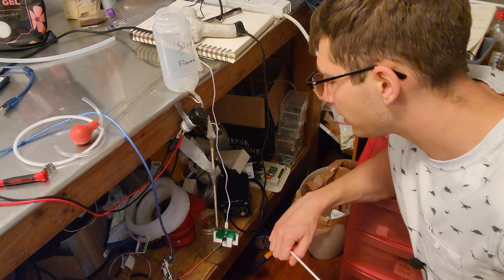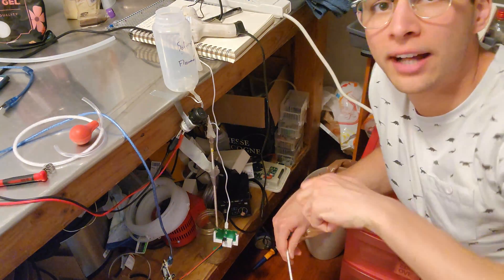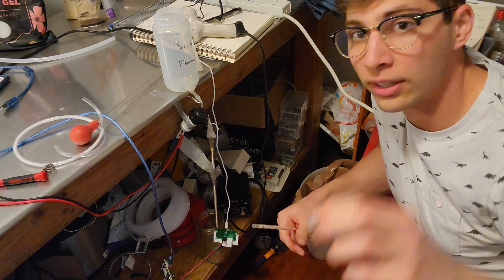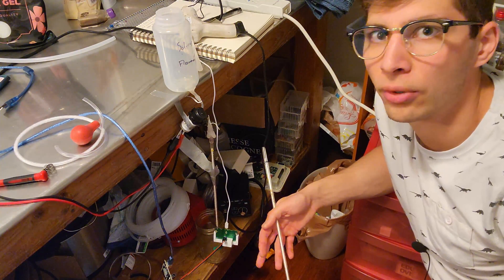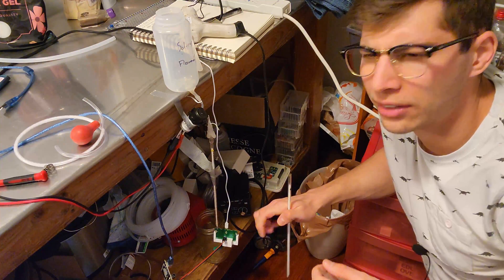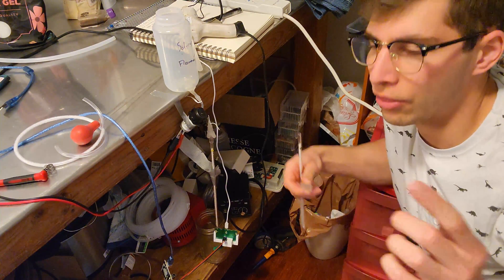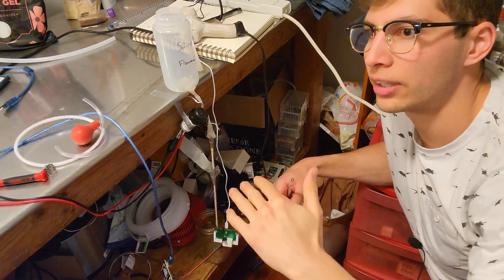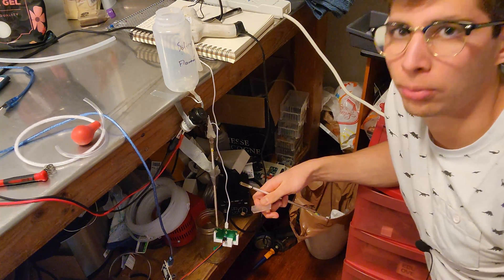The last issue I see is on the detector side. I never got the detector to work fully. I did try using little cuvettes with a 3D-printed detector — the UV light on one side and the sensor on the other — and you could put the cuvette in with your sample and see if the reading changes. That worked okay. But one of the things I noticed is that the detector has a long warm-up period: when it sees UV light, the readings spike up really high and then very slowly come down, and I never reached a point where the readings were stable. So maybe this detector is just not appropriate for this application.